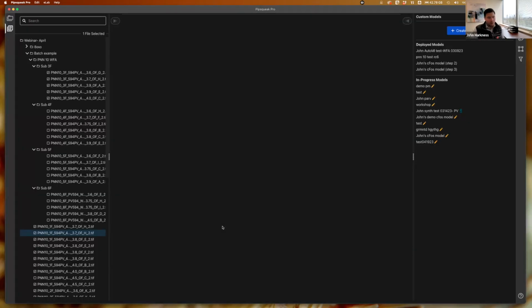Something that we're working on in the hopefully near future is the ability for you to start tuning your models more specifically from some of these save points that you've created. So if you train a model and you'd like to go back and tweak it, one thing we're working on is for you to be able to say, I want to just retrain this model, maybe try it again with some different parameters. So not something that you can do right now, but Ahad, hopefully that gives you an idea of what we're working towards, where this is going. So yeah, great question.